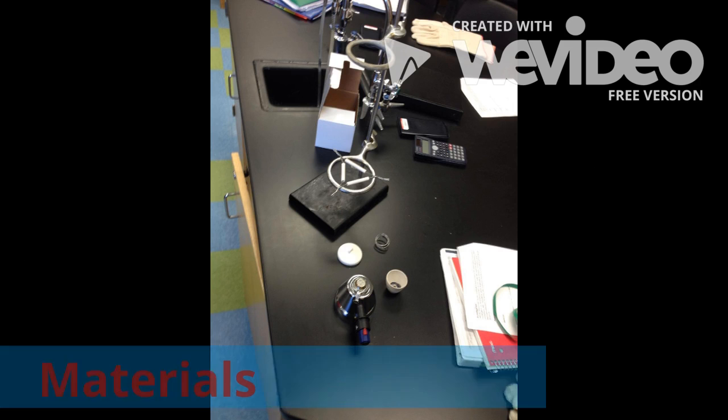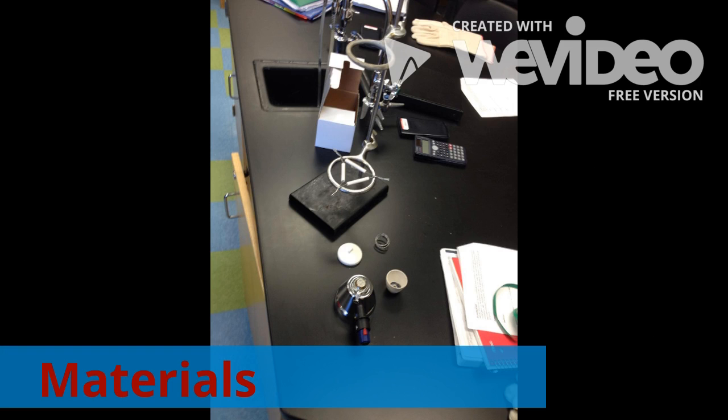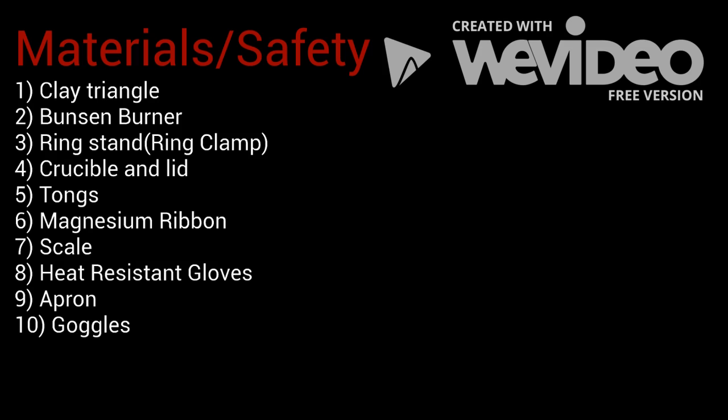Materials. You need a clay triangle, a Bunsen burner, a ring stand, crucible and lid, tongs, magnesium ribbon, scale, heat-resistant gloves, apron, and goggles. Data and calculations.